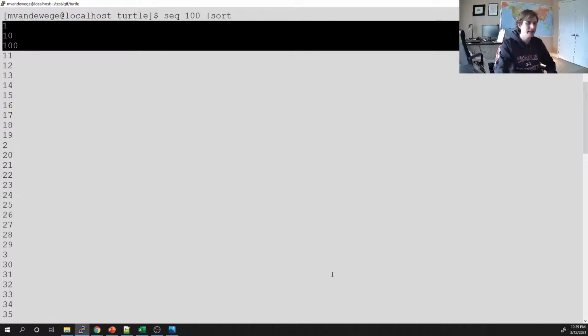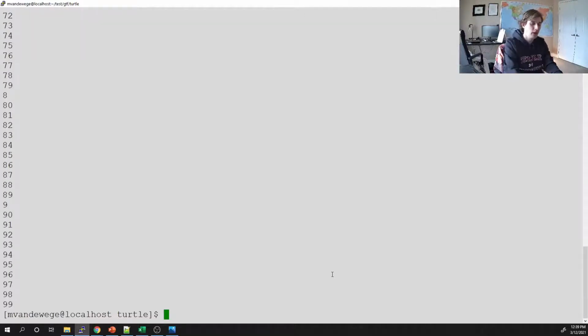If I had 3 digits in a group, computers would sort if it were like 001 or 010 or 100, right? It's going to sort that better because now everything all has 3 digits in it. It starts at 001 and goes up to 100, right? That's how computers like to sort.